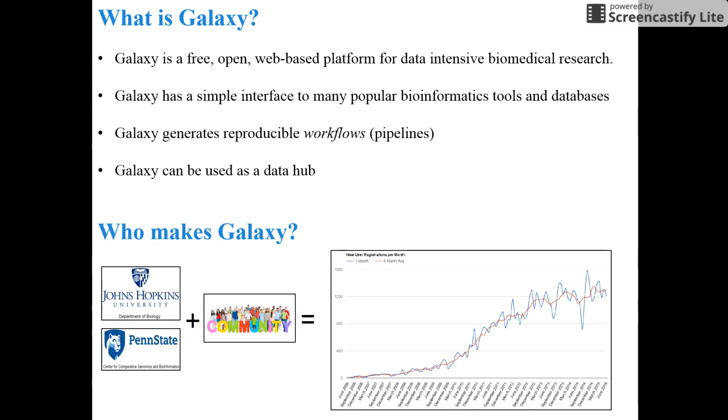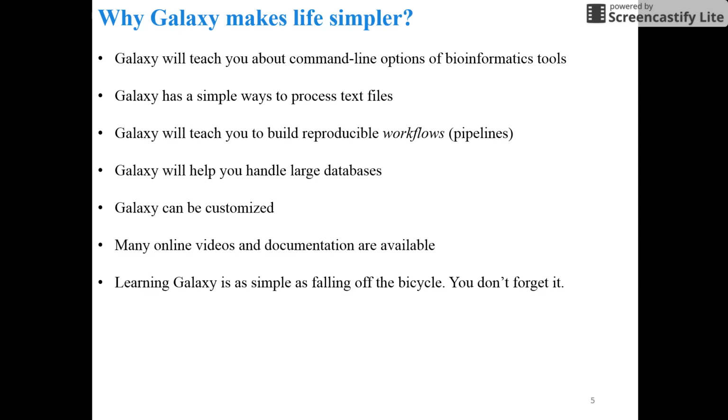It's free, it's open, it is a web-based platform for biomedical research. All the data is being downloaded to your Galaxy environment, never to your computer, but you can download it to your computer. The interface is very simple, and most importantly, you can generate pipelines. So a command that calls another command that calls another command, and you can reproduce those, you can share those, and you can print those and include them in your publication or your lab report. It is developed by Johns Hopkins and Penn State and a very large community of users.